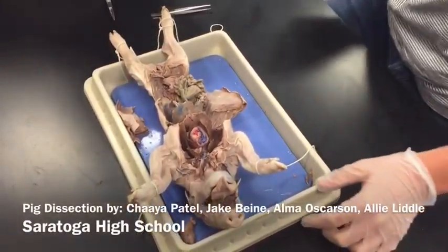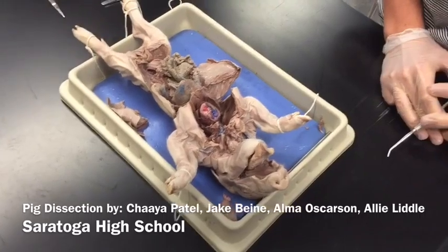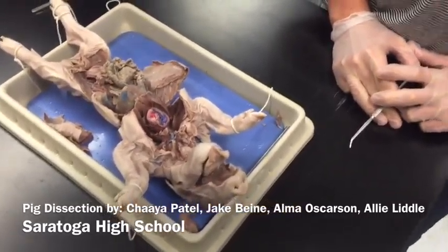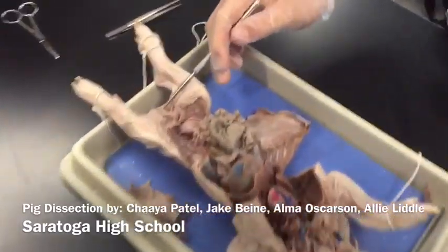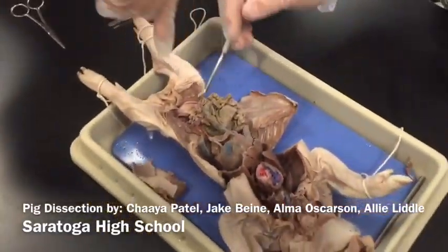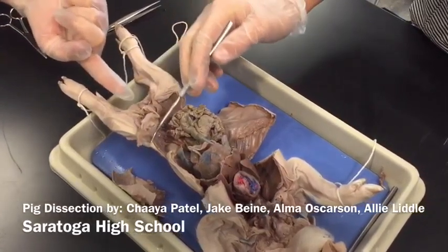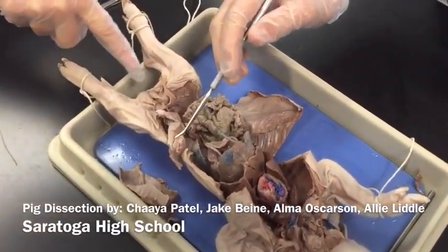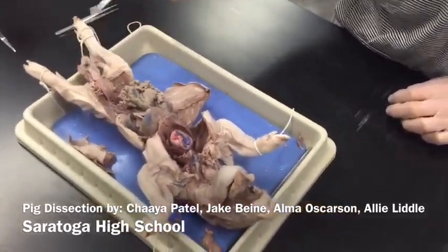Okay, hi. So now we're explaining the pig anatomy. Our pig is a male, and we know that because on the umbilical cord, it has the little hole under it that you can see, and it doesn't have a bump near its butt.